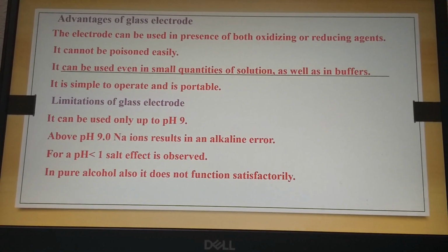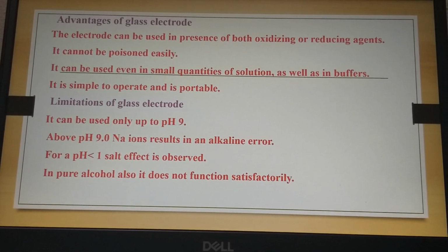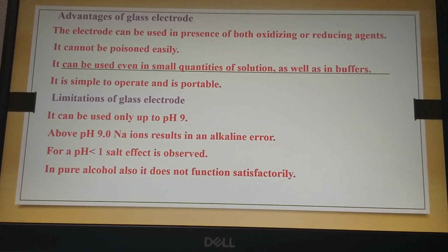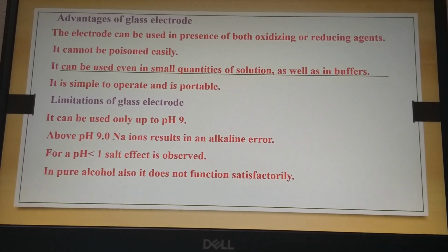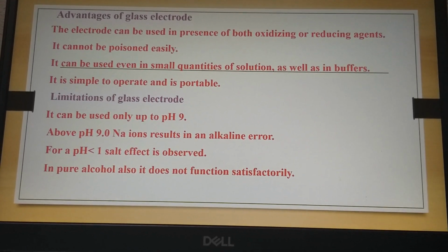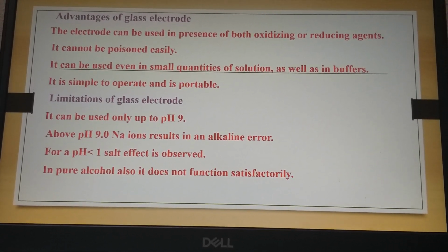We can take it anywhere and we can measure the pH of any solution, which is very important these days. Therefore, glass electrode is a very important ion selective electrode.